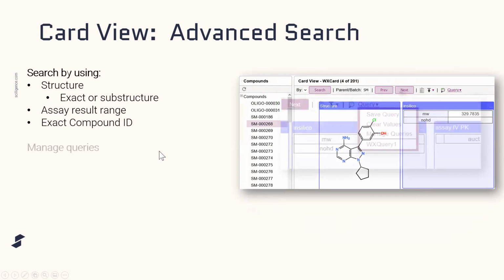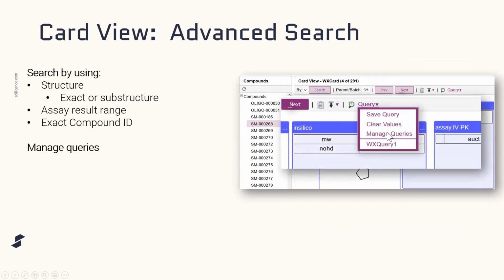related to it. Okay. You can also manage the queries. So instead of having to search over and over again, you could save your queries. You can manage them so that they can be shared with colleagues, or you could just wipe it clean and start all over with this little drop-down box over here.